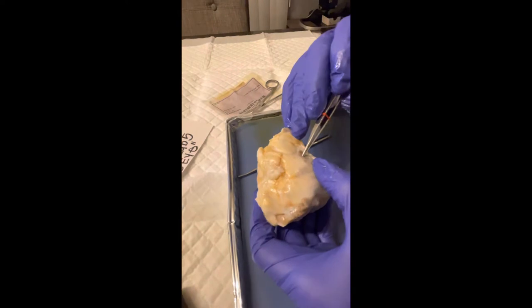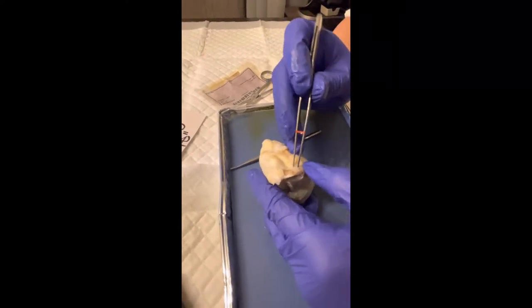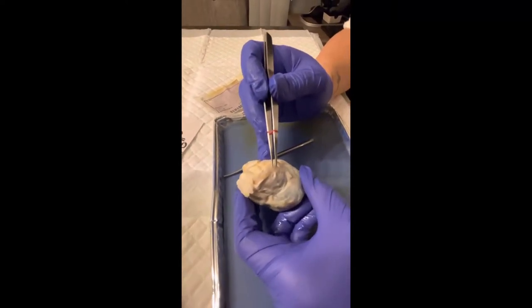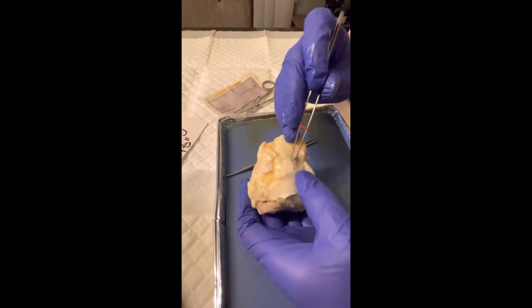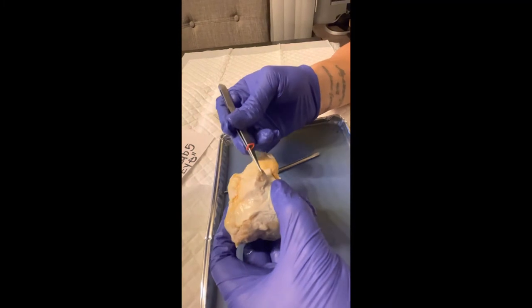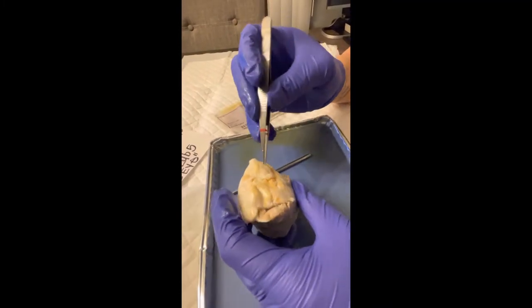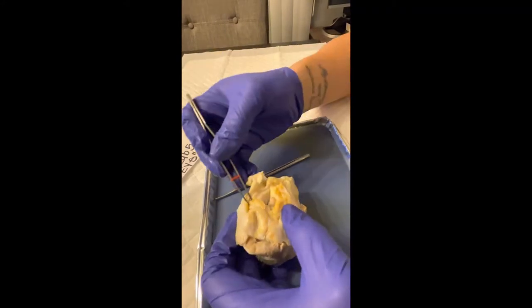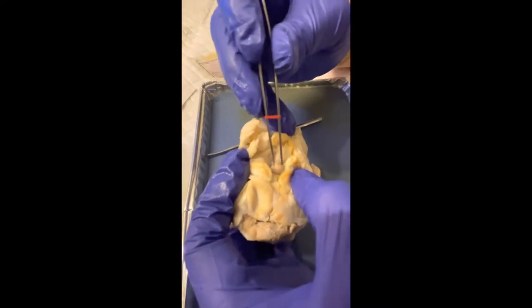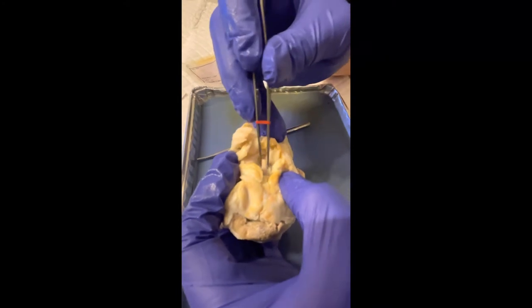Now moving over to the back side of the eyeball, you should be easily able to find the muscle, which is sort of a darker, more brown color as compared to the fat, which is a yellowish white color. And between all of that, you may have to dig around a bit, just as I did, for the optic nerve. The optic nerve is super comparable to a wire-like object for the eyeball that signals information to be sent to and from the cow's brain. Best known as a sensory pathway, being that the eye is a part of an entire sensory network.